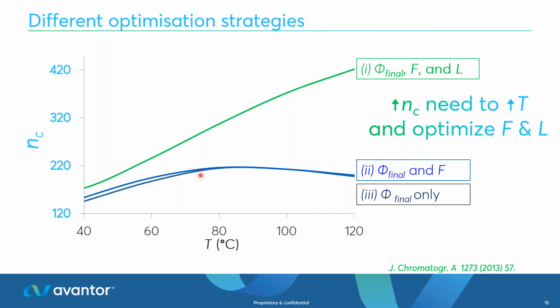You're going to decrease the back pressure that's observed on your system. And also you're going to have better mass transfer kinetics. So please move out of your comfort zone, increase that temperature to as high as possible. Obviously, you want to make sure that it's compatible with your column, your stationary phase, your system, and also all of the accessories and connections that are exposed to this temperature environment.